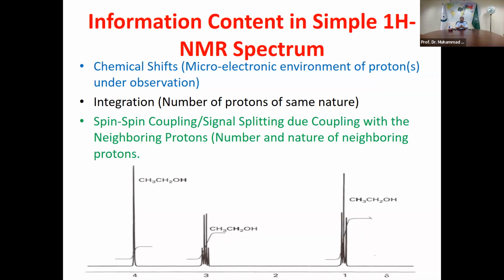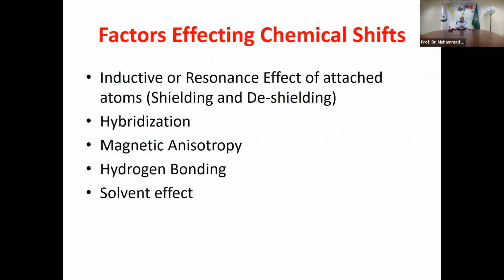So, depending on the electronegativity of the attached atom, this is one factor, which is explained in this case, the inductive or resonance effect.